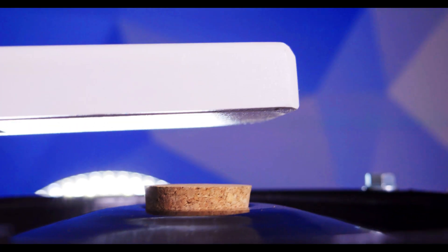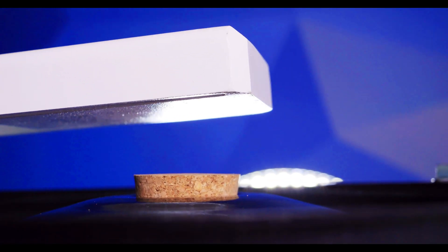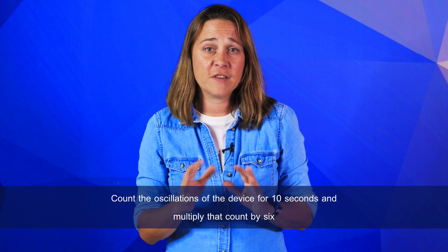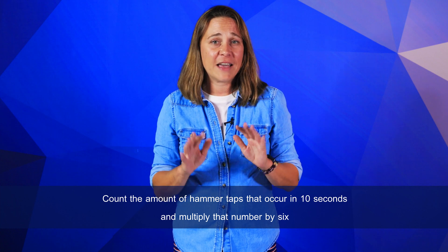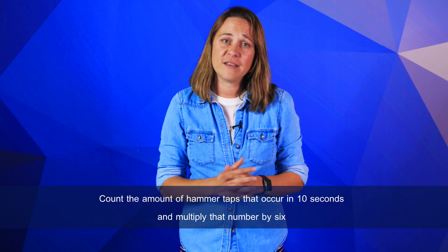Of all those performance specifications, the number of oscillations and hammer taps are easily testable — in fact, they're simple mathematical equations you can use to test a Rotap's performance in-house. To test the amount of oscillations per minute, count the oscillations of the device for ten seconds and then multiply that count by six. Testing the hammer taps per minute is very similar: simply count the amount of hammer taps that occur in ten seconds and multiply that number by six.